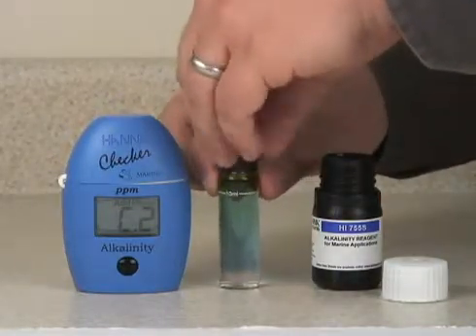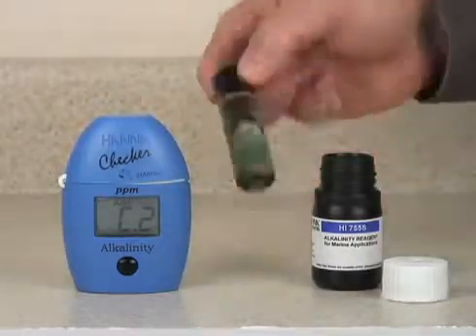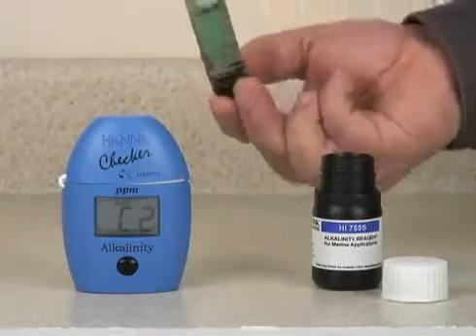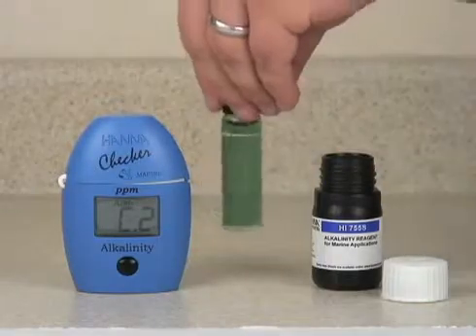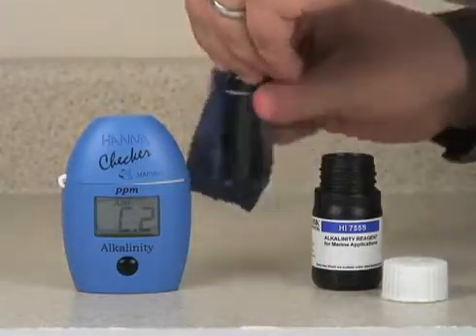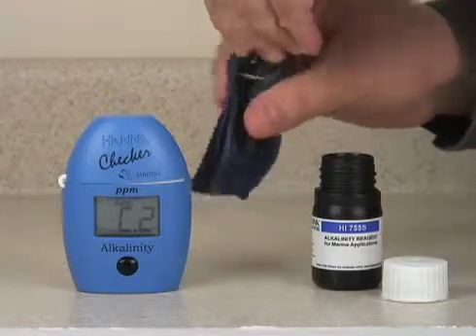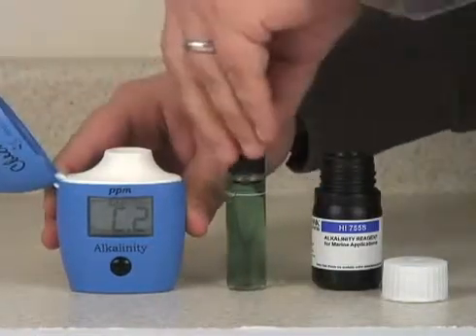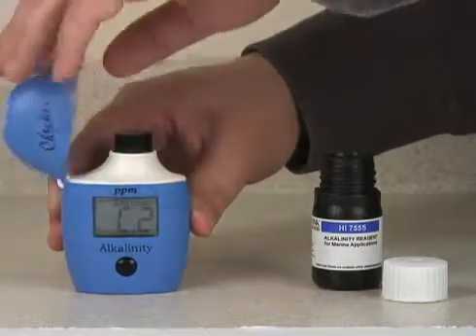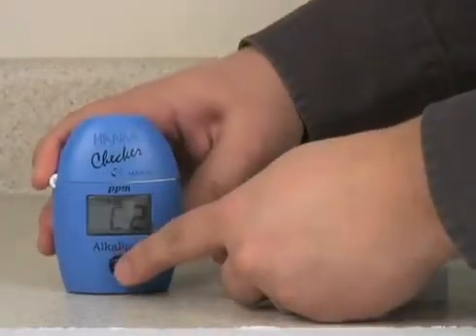Replace the cap and invert five times to mix. Wipe the cuvette again, then reinsert into the meter and press the button to read.